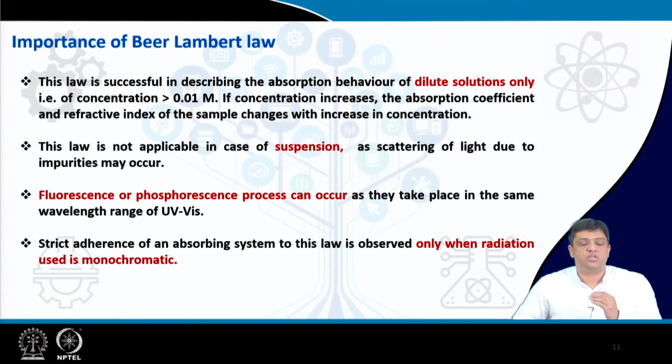Strict adherence of an absorbing system to this law is only observed when the radiation used is monochromatic.